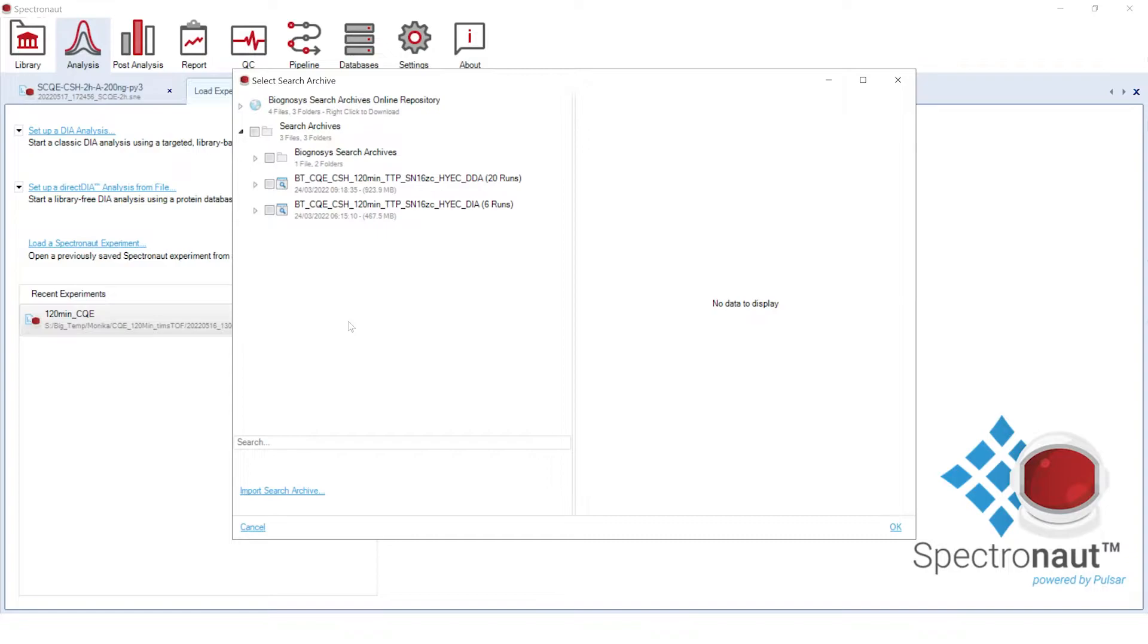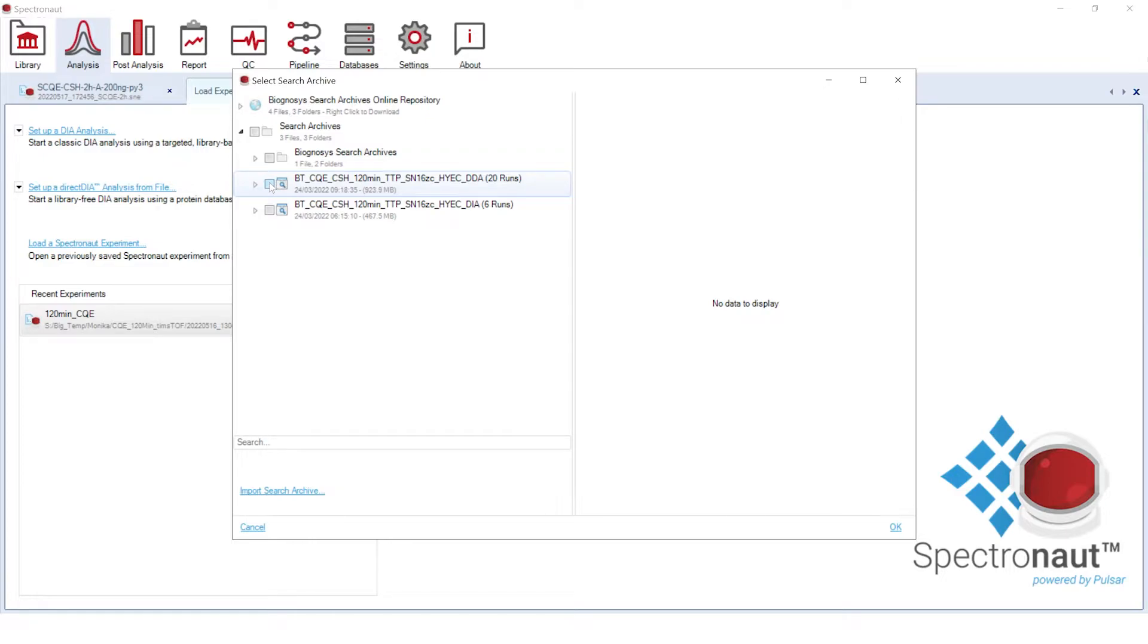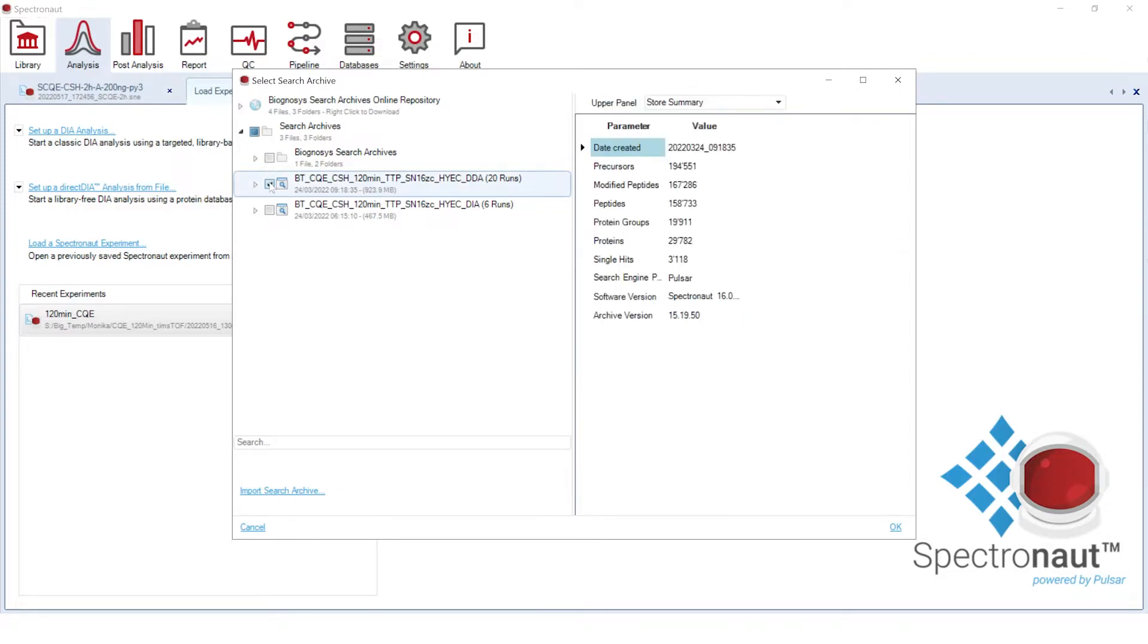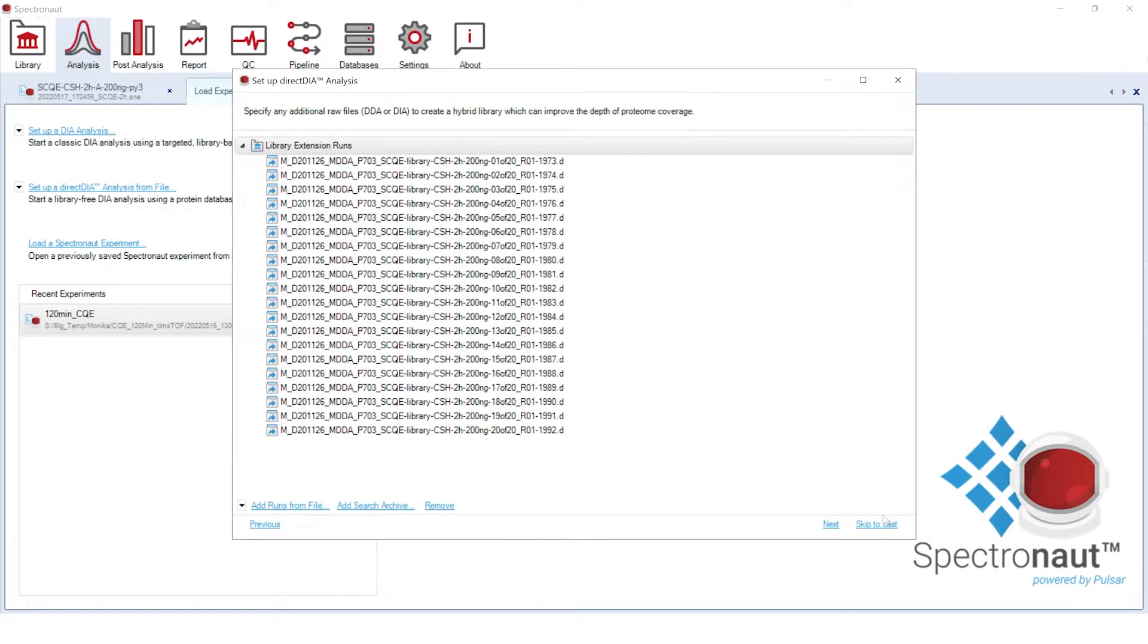Whether you use runs or search archives for the library extension, Spectronaut will make sure that you get a library that is FDR controlled, which is 1% at PSM, peptide and protein group levels by default. In this video tutorial, we will enrich direct DIA using search archives of deeply fractionated two-hour DDA runs acquired for the same four species samples.